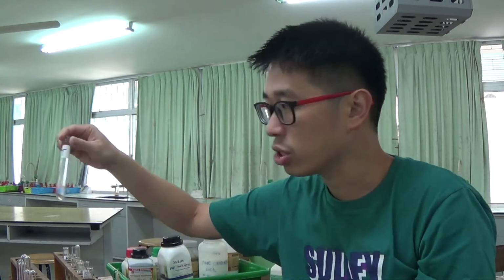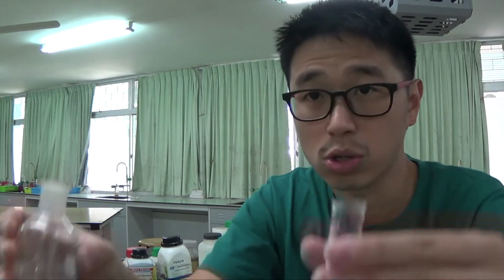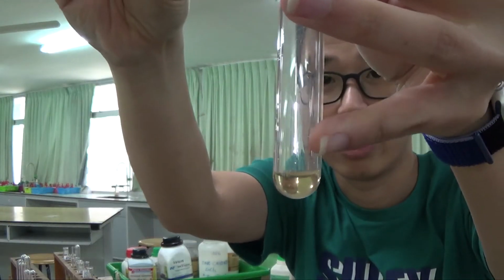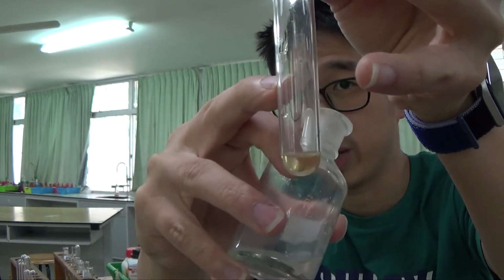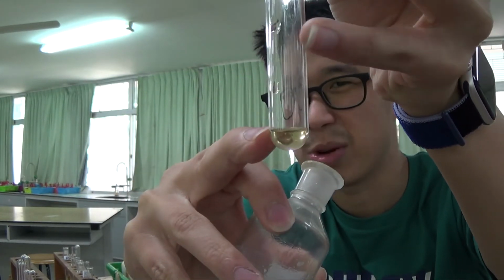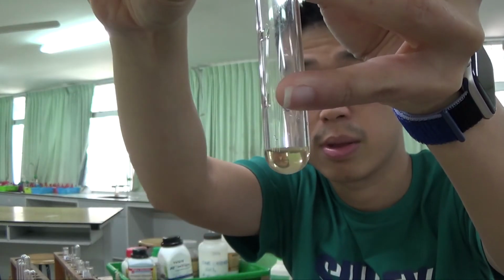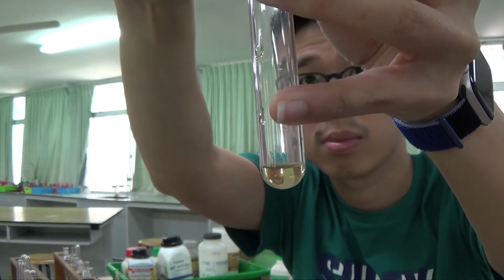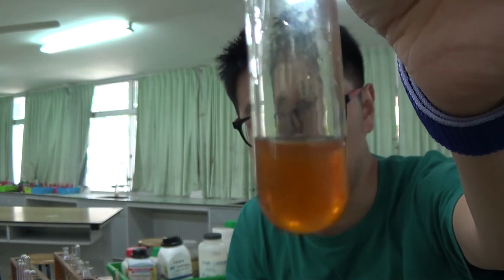Now to the other portion of the solution, I will add some sodium hydroxide. So I have this much solution. By right, usually we start with 1 cm³ and then we add 1 cm³, but this is probably less than 1 cm³, so I'll probably add around this level only. Okay, and I get a similar kind of result.